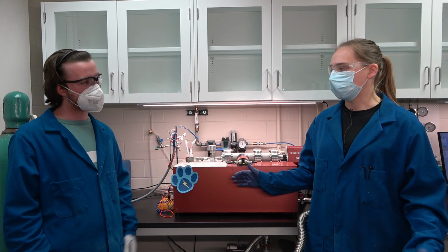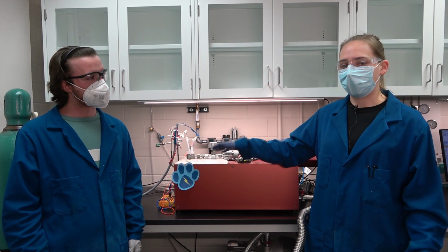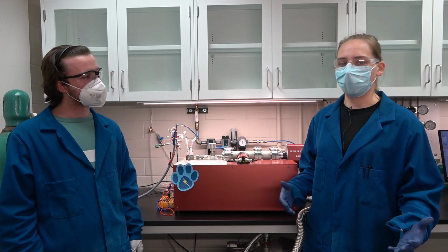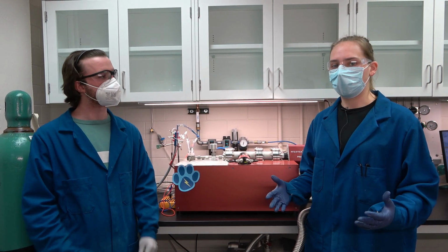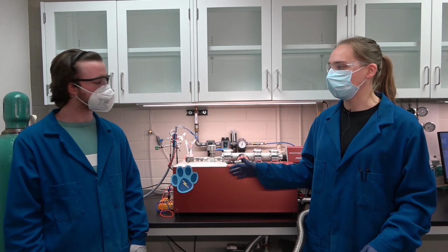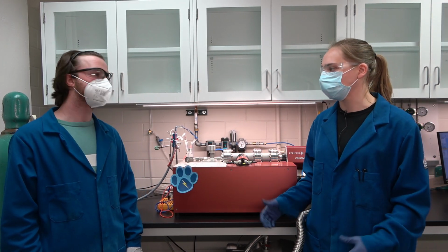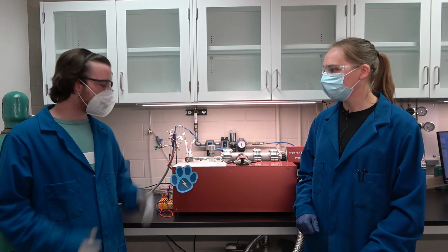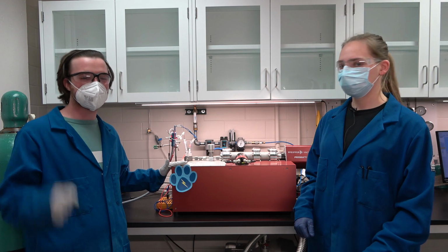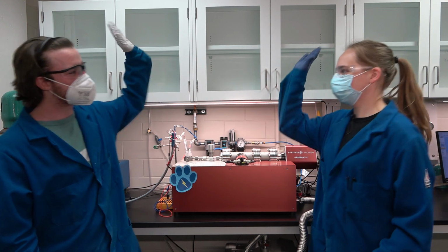It's a great question, Zach. We use the DEMS for a lot of our valorization investigations, where we try to turn simple molecules like alkanes into something more complex that can be a platform chemical in industry. And the DEMS gives us insight into the basic reactivity to accomplish these challenging reactions. Awesome, that makes perfect sense now. You cracked the code. Valorization is the second clue to solve our mystery. Thanks, Christine.